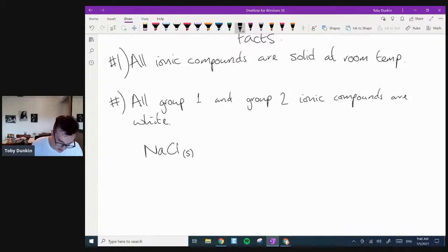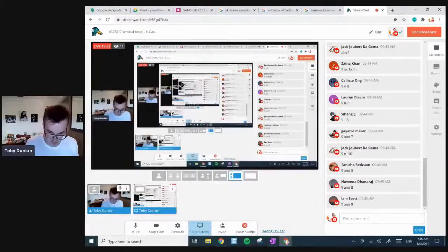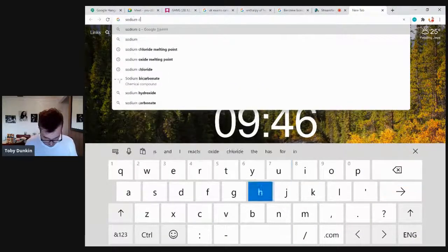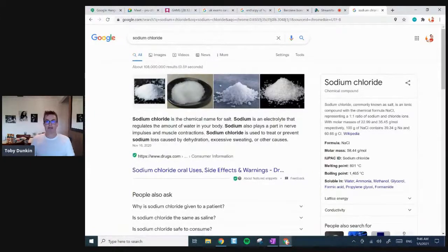Sodium chloride is a solid at room temperature, and it is white. Let's just check that out. It's always nice to prove a point. So sodium chloride. There we go. It's a white ionic solid. I think everyone would agree with that.